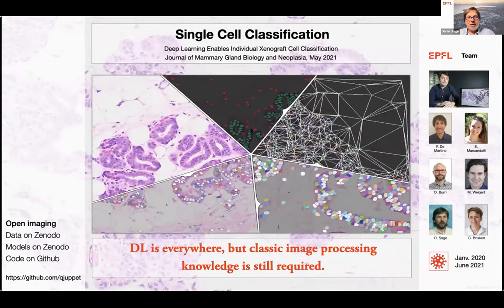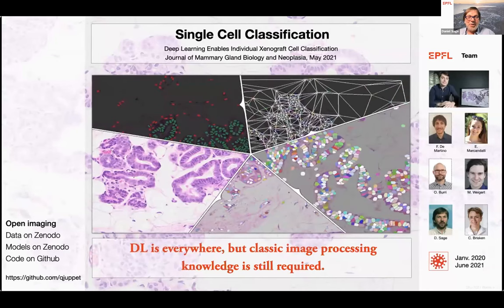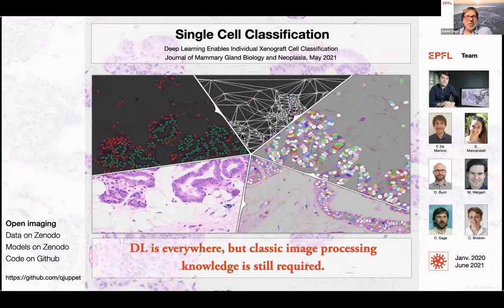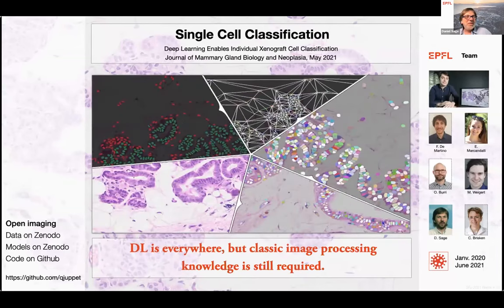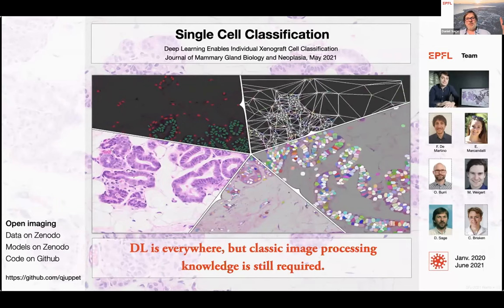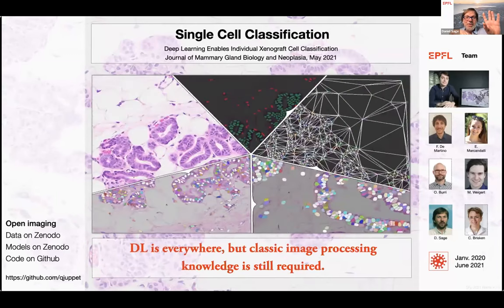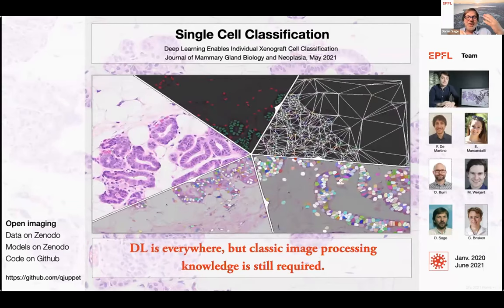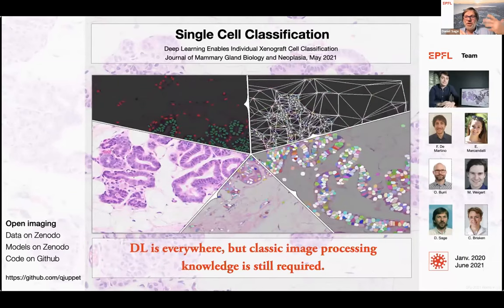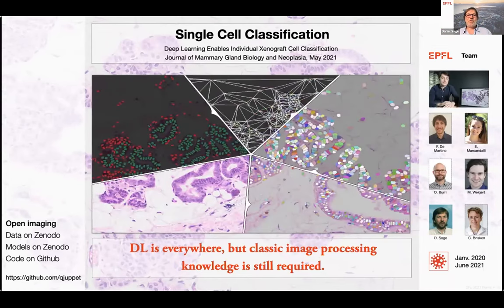Federico Rossi asks, for instance, a typical application I have in mind is tracing the morphology. The one that I see there is a really difficult question. So tracing the morphology of neurons in 3D stacks is probably something really difficult to do fully using a deep learning system. What I would probably do is split it into two phases. The first would be to design some kind of filter, denoising, these kinds of things in 3D, and train a system to achieve this task, to have neurons that connect better and so on. And then it will help to make the connections and to have the full tracing.